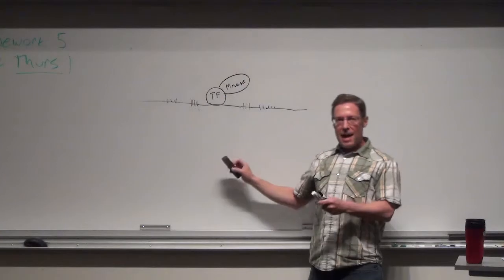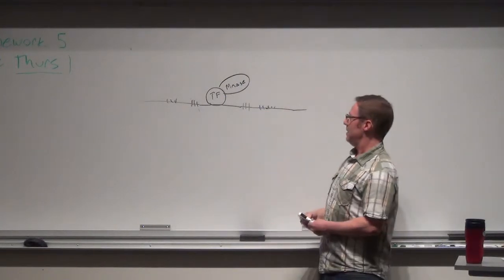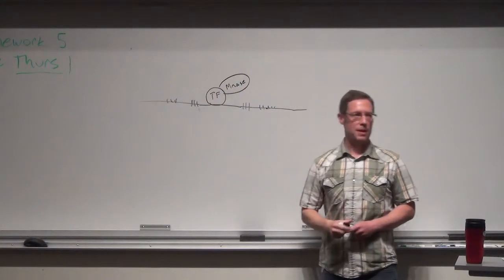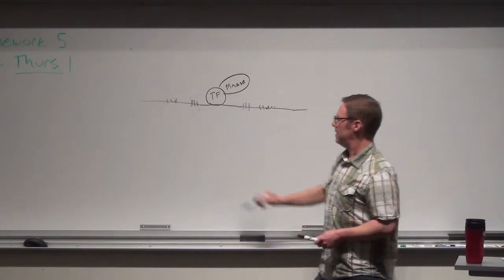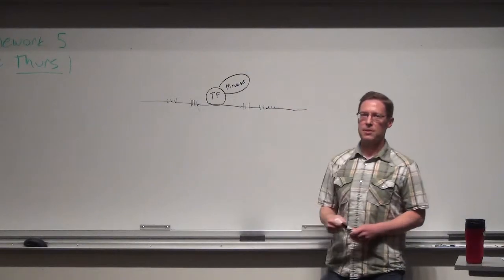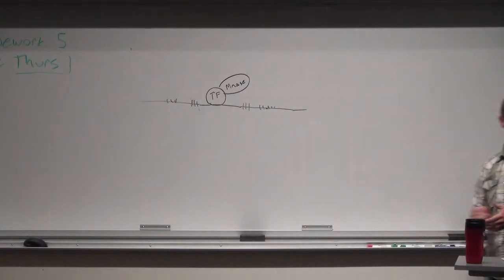So your task now, I'm going to give you this ChEC-seq data, and your task is to write a function that tells you how close the slow peaks are to the fast peaks. You're going to get a set of sequence coordinates for the fast peaks and a set for the slow peaks, and we can ask, do the slow peaks overlap with the fast peaks? If they do, we wouldn't definitively conclude that they're artifacts, but it would certainly make us more skeptical of them. But if they're not, perhaps we're inclined to think there's something real. All right, any questions so far? I know I'm hurrying this along a little bit.